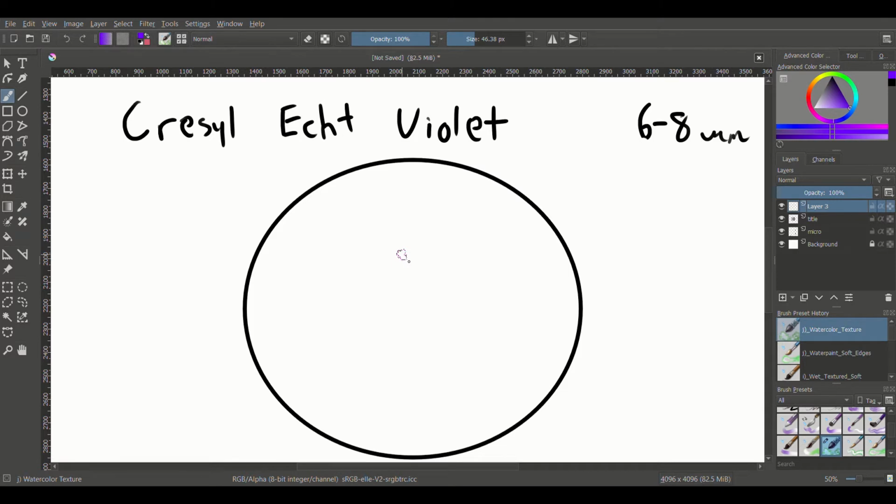So what we're going to do is put the whole section in the balsam xylene, and then we're going to differentiate in absolute alcohol, and we're just going to keep putting it through absolute, checking it, and then putting it through xylene. So it's going to look like, let's say we have a bunch of Nissl substance here, and we have some surrounding nuclei.